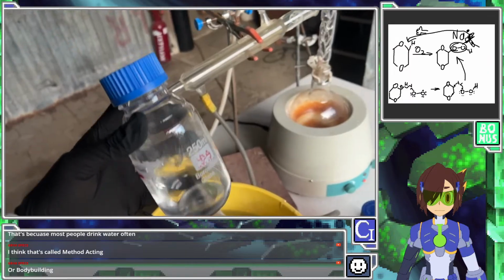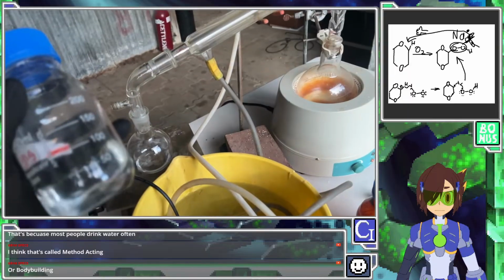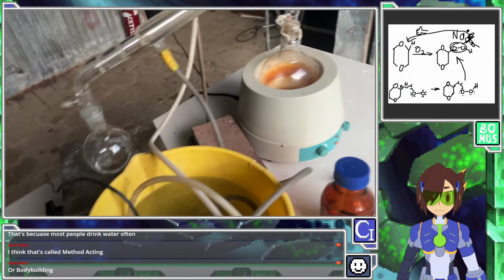We also have non-anhydrous dioxane. This is stuff that came over with the water azeotrope that boiled below the pure dry dioxane. So we could dry this out and redistill. It's roughly 20% water dissolved in the dioxane. Give it a shot. I've not nailed this synthesis at all.